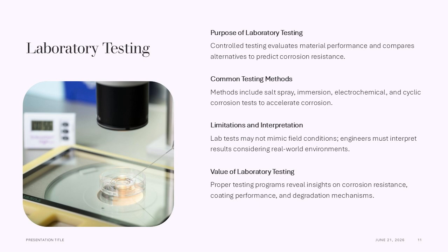While laboratory tests may not perfectly replicate field conditions, they offer repeatability and standardization essential for quality control and material qualification. Engineers must understand the limitations of laboratory tests and interpret results in the context of real-world service environments. Properly designed laboratory testing programs provide valuable insights into corrosion resistance, coating performance, and degradation mechanisms.